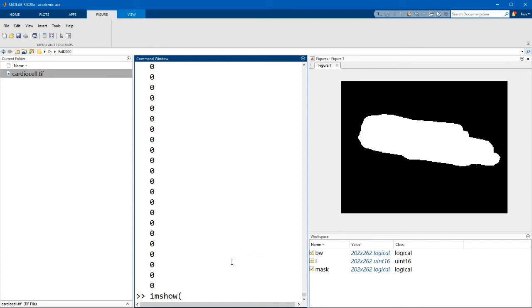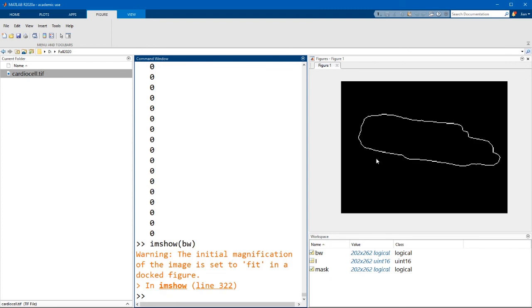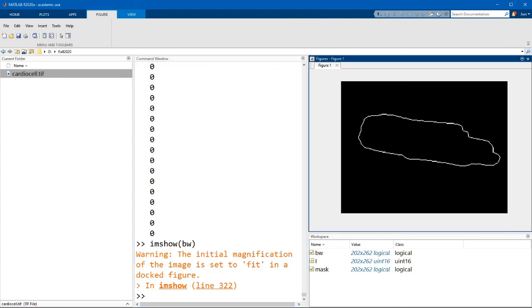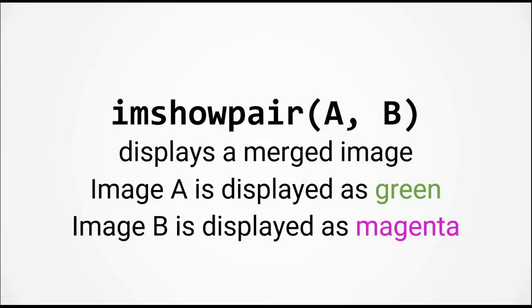Now if I display what this image is, you can see that it contains just the perimeter of the object. Now to display both the original image and this perimeter image, we're going to use the function imshowpair.